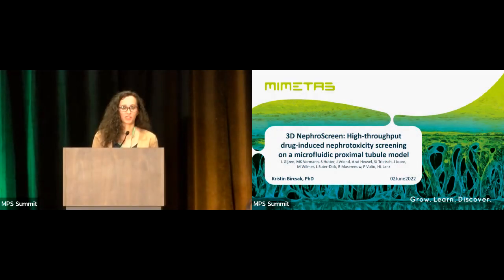I'm very excited to share with you an overview of a study where we employed a high-throughput proximal tubule on a chip platform for nephrotoxicity detection.